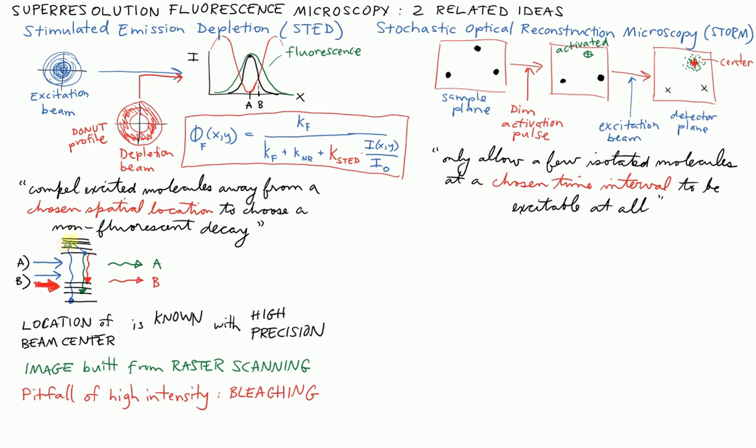What does the energy diagram look like here? The concept is that you can start out in some sort of ground electronic state, and we'll call that the dark state. That's where all three of these molecules begin. When you absorb the excitation pulse, it makes a transition.